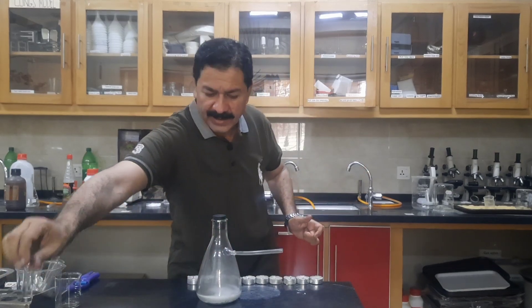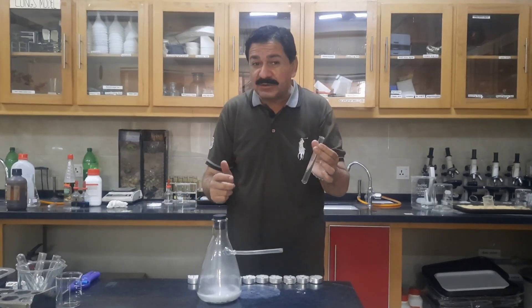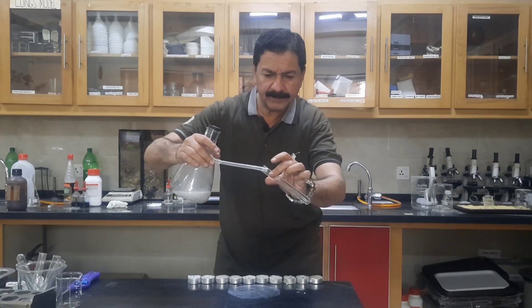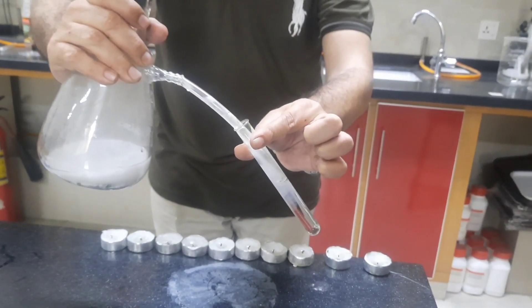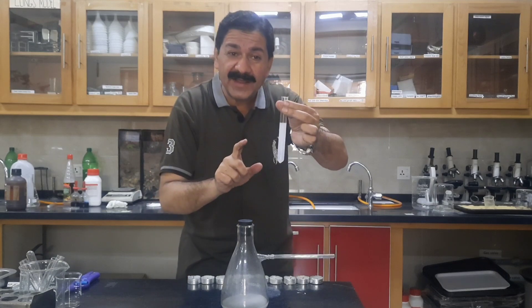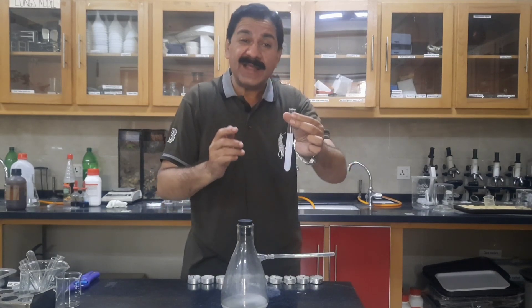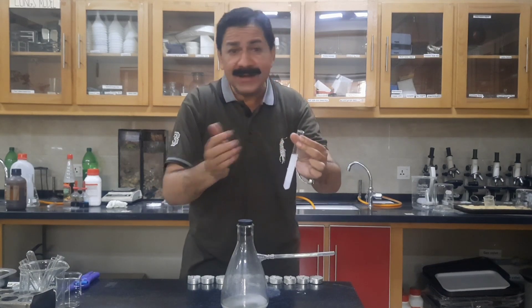So here I have lime water. Lime water is a dilute solution of calcium hydroxide. Lime water turns milky because carbon dioxide gas reacts with lime water to produce calcium carbonate, and lime water turns milky.